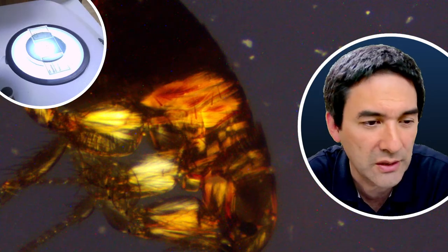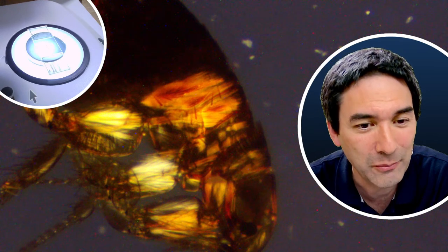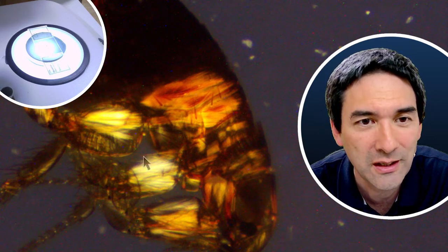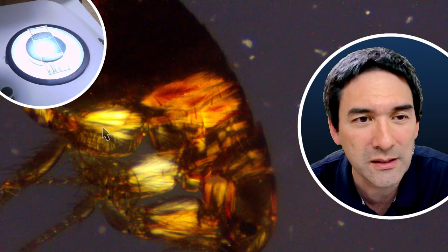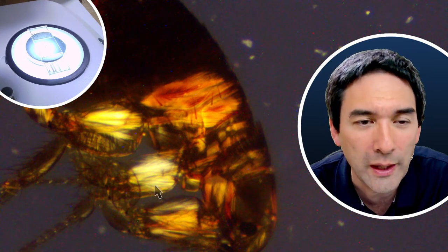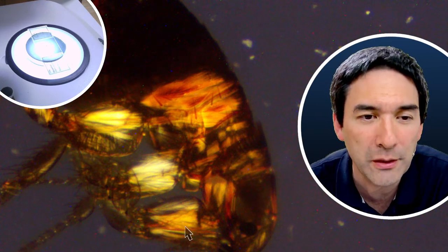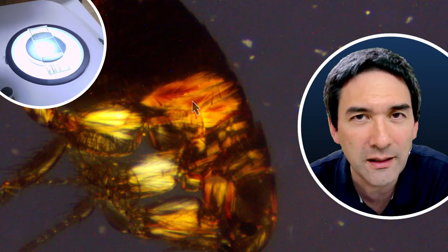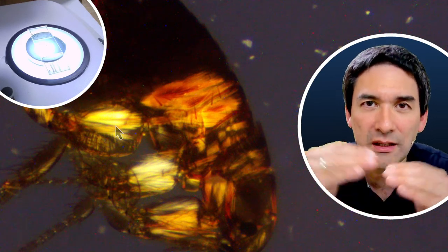When I checked this out today in the afternoon, because I was looking for some samples, I was really happy. I need to explain this a little bit, because I'm going to show you an arrow over here. All of those bright things that you see here are muscles. I really like this. These are muscles that are attached inside the exoskeleton of the dog flea. You do not see it here quite well, but when you look through the microscope itself, you see the individual muscle fibers much better. And the question is now, why do they actually turn the polarized light? I think the reason is that those muscle fibers have protein filaments, so-called actin and myosin, which are aligned.